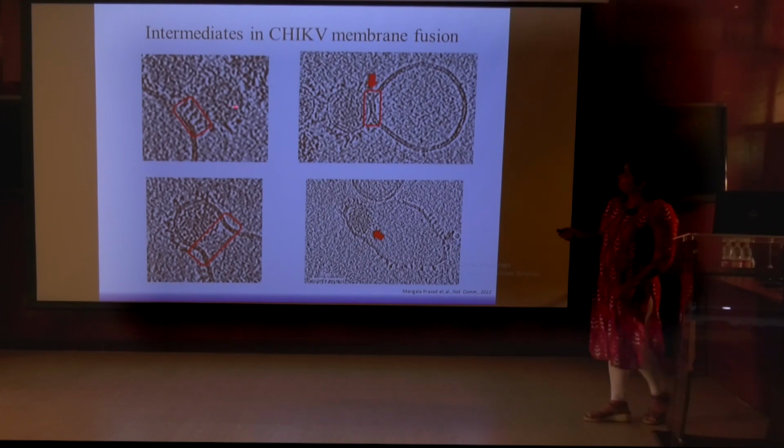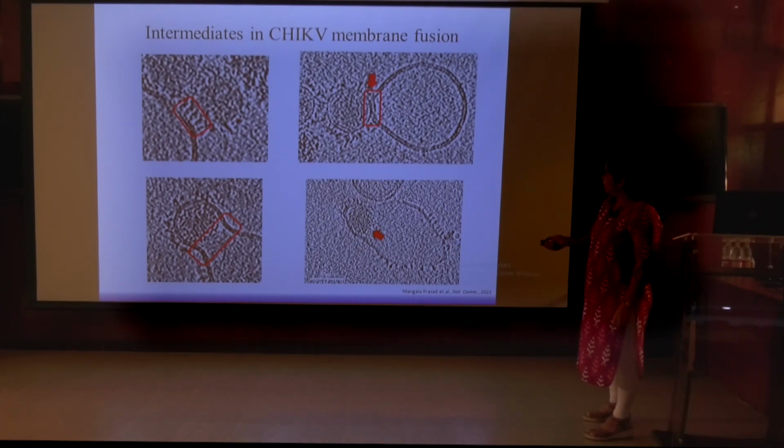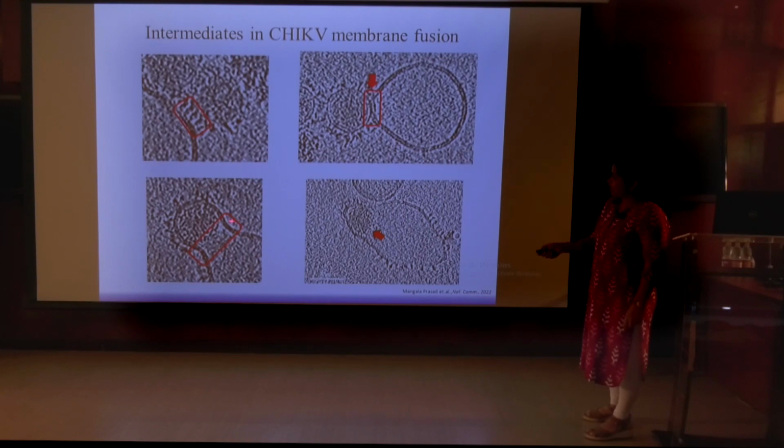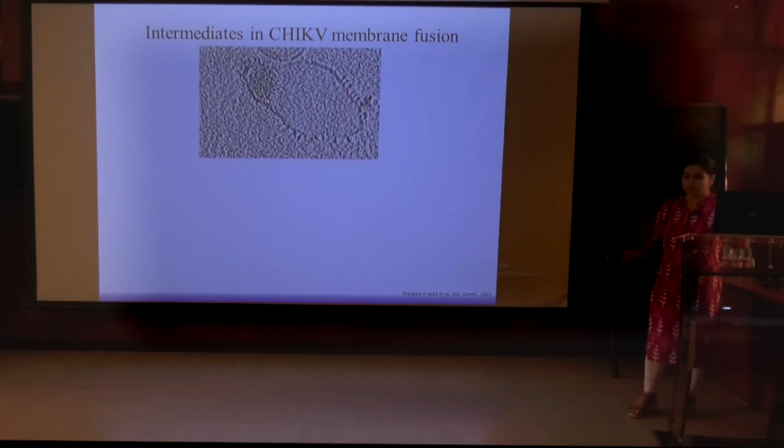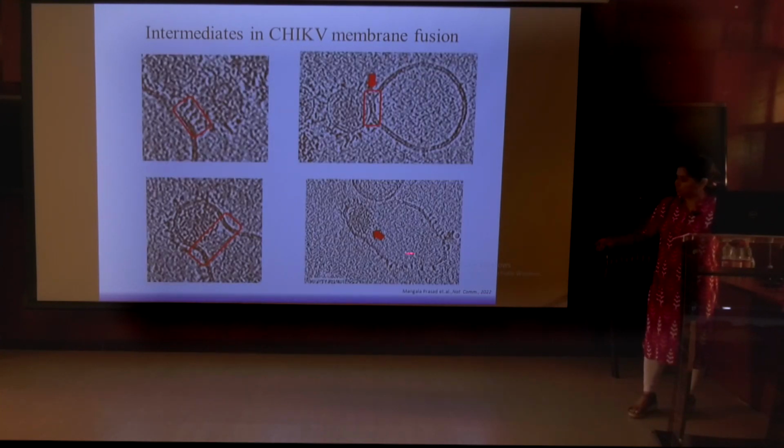But what I want to show is that between the different viruses that we can look at, we can actually see how the protein rearrangements are taking place. We can see how the different membrane regions, here we have the membrane of the virus and the membrane of the liposome, how do they come together. We can also look at how they actually fuse, what kind of hemifusion will take place, and how the nucleocapsid gets released into the cytoplasm, in this case, inside the liposome.